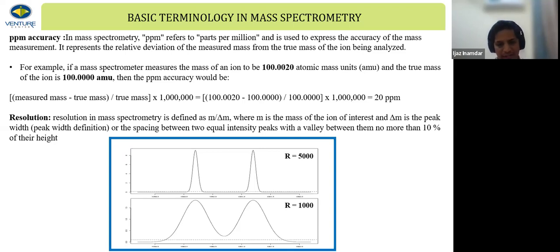They say that we'll consider your method to be okay, resolvable, when your resolution between a critical pair of peaks is at least 2. In HPLC, it is at least 2. So resolution generally defines how well your peaks are resolved. If peaks are very well resolved, the resolution will be very high, and if your peaks are not resolved, then the resolution might be low. Again, what is the limit to get high resolution? Generally, minimum 2. The official requirement is 2.